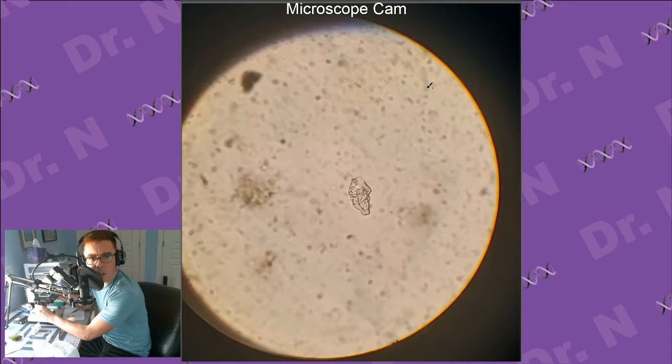I feel like if I take a dirtier sample, there would be more things in it. When I've done this other times, you can always see something swimming around. This might just be a fairly boring bit of moss that I found. If I don't find anything very quickly, I'm just going to switch and get some more. It's also always hard to tell. There's some little dots that are spherical and clear. Those are probably just bacteria. Bacteria are pretty easy to find. I was hoping for something a little bit bigger, maybe some water bears or something like that floating around.